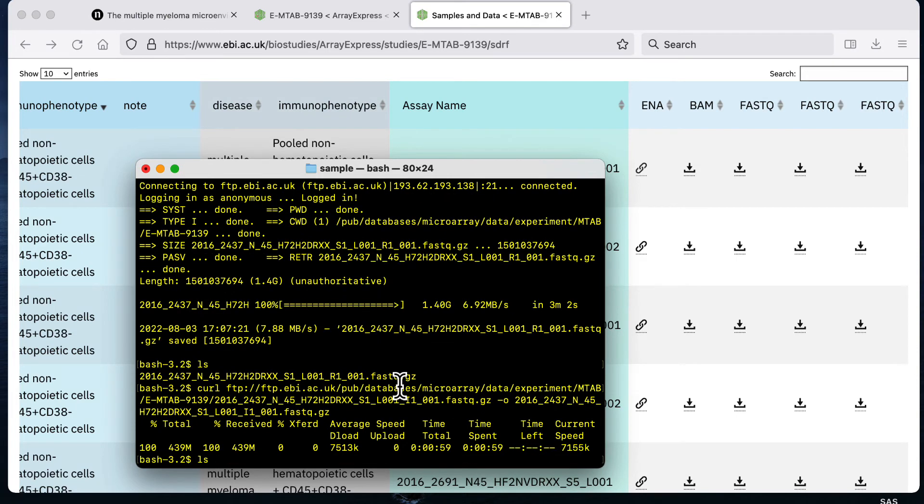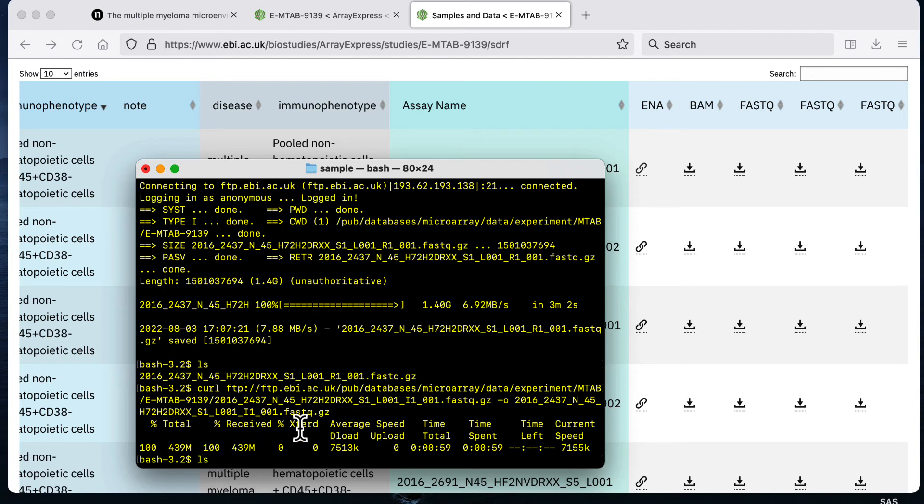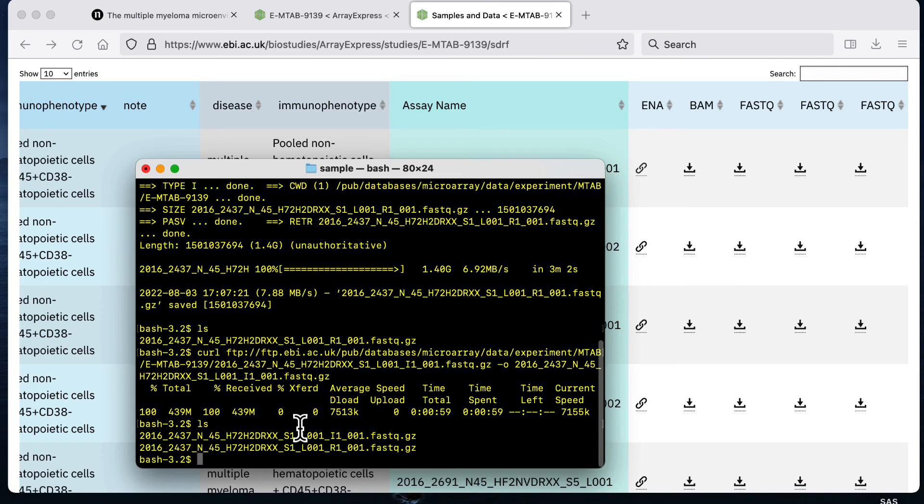That second file took another two minutes to download and then when it's done I'm just going to type in ls to check the contents of my sample folder and we see that we now have two files in that folder.